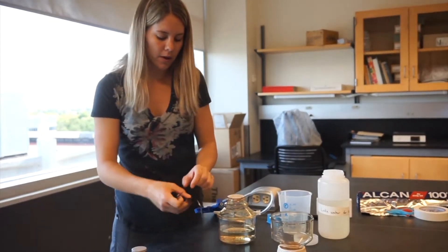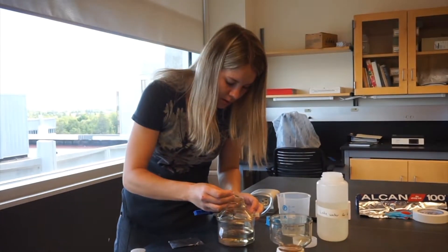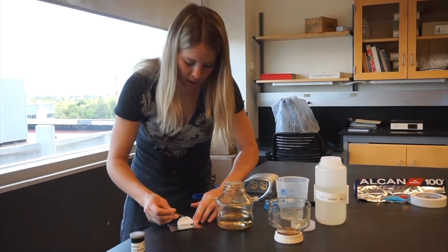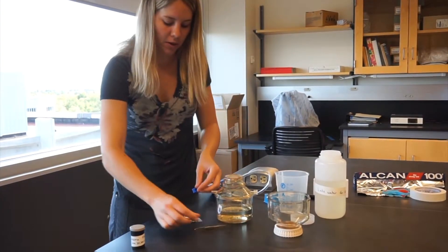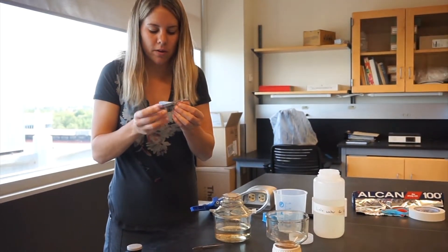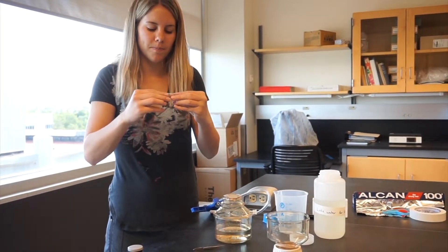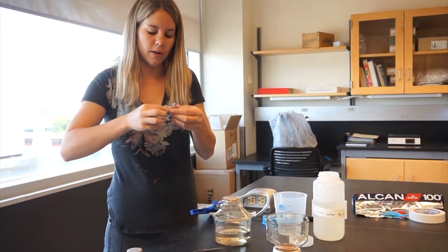Using the tweezers, carefully remove the filter paper and place it on your foil. Fold it in half once so that the filter paper is folded in on itself, and then you can fold this into a square.